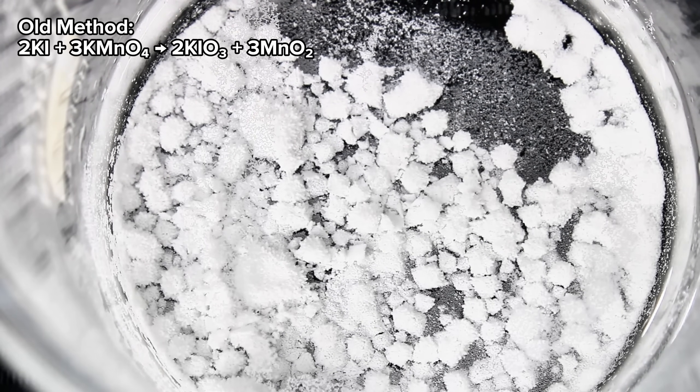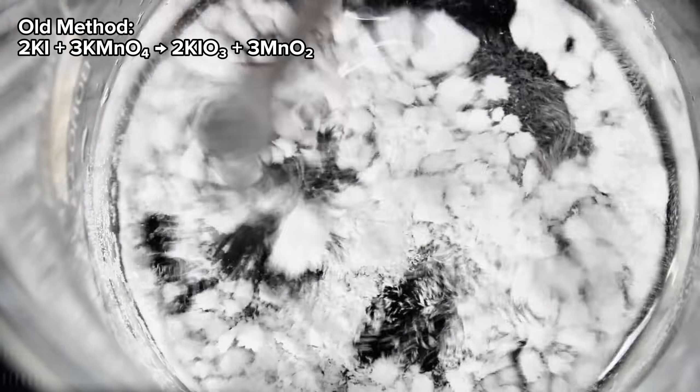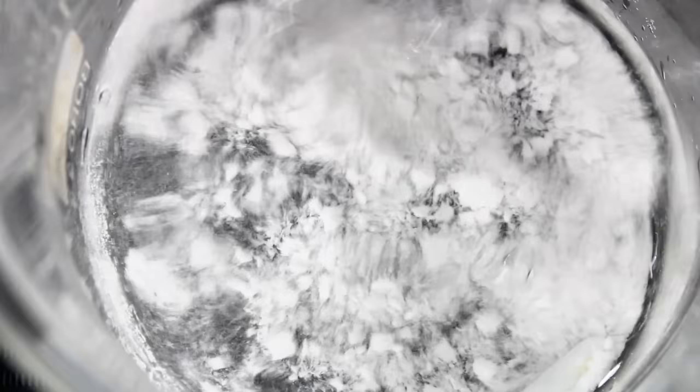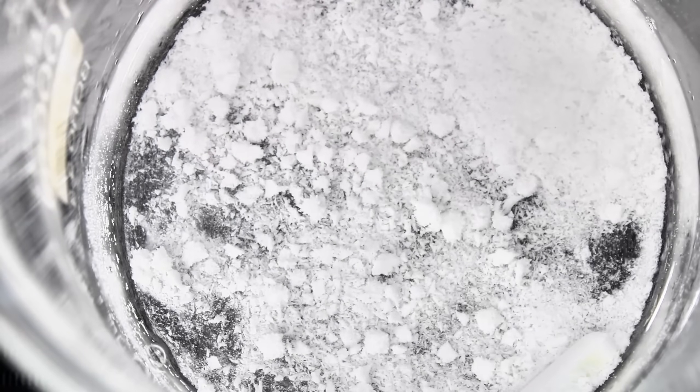Technically I've made potassium iodate before on this channel by the oxidation of potassium iodide using potassium permanganate, but I found this method to be faster, cleaner, and higher yielding. I've also developed a simple purification step I hadn't thought of in my old video, which resulted in a much purer product as well.